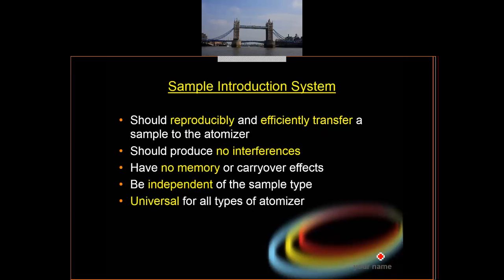Okay, this is the sample introduction system. It's just piping. It sucks a sample from a glassware or from a beaker and puts it in the atomizer. Okay, the atomizer will burn it.